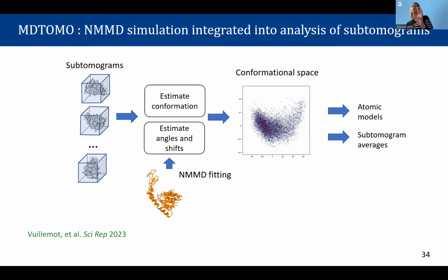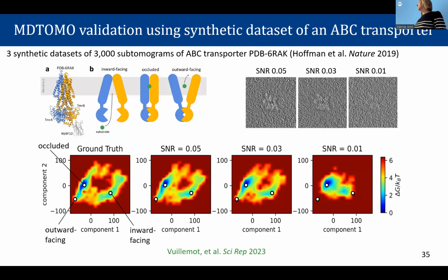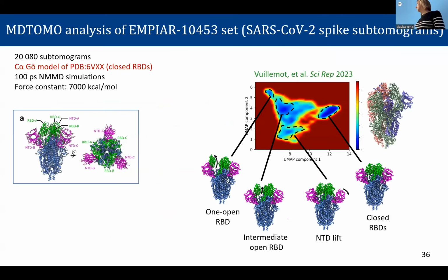If you remember, I was speaking about 3D fitting. In MD space, we are doing 3D to 2D fitting, and here 3D to 3D fitting. So it looks easier, because the noise is not as evident. We analyzed this and showed that it works with synthetic data and with experimental data. I can show you the movie: the SARS-CoV-2 spike data.